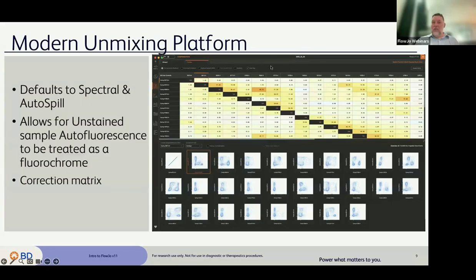Once you create the matrix, you will get access to things like unmixing correction option and spillover spreading, similarity matrices, which is cosine similarity between the fluorochromes, and then total spread matrix, which will only be calculated if you do true positive negative gates, because that's what that calculation depends on. But we get a nice display. You can toggle on and off the heat mapping.